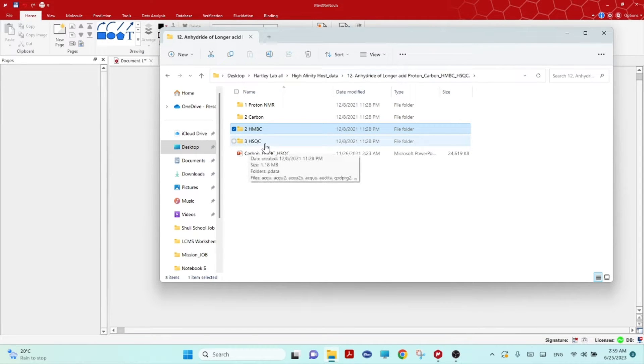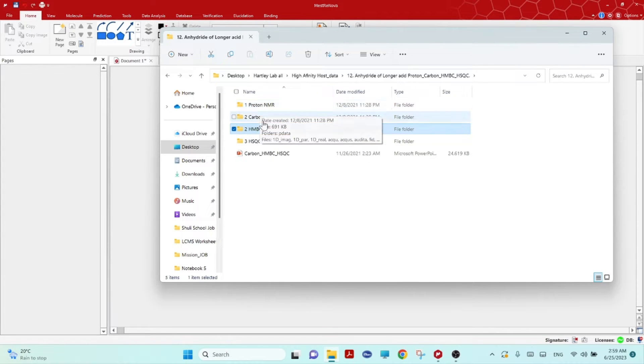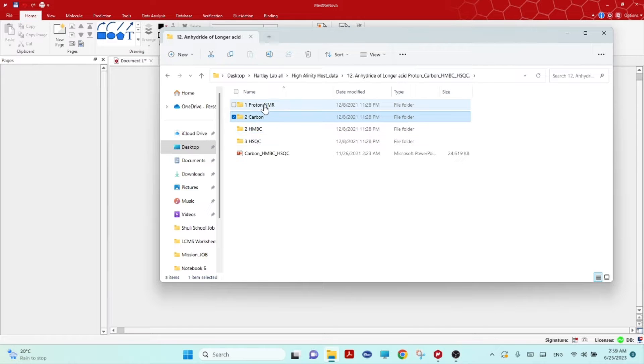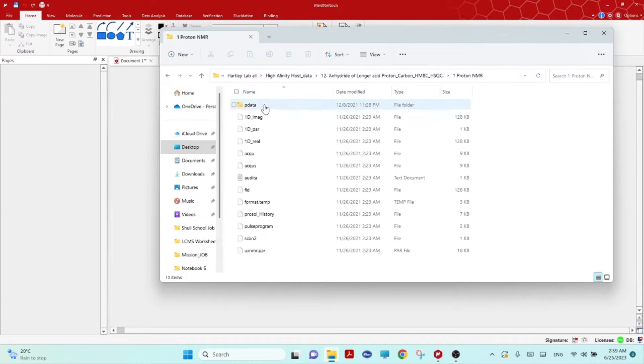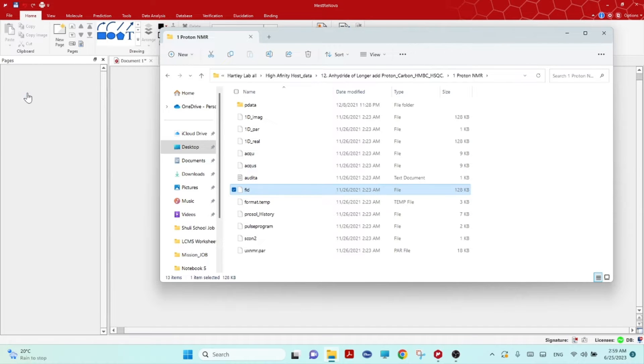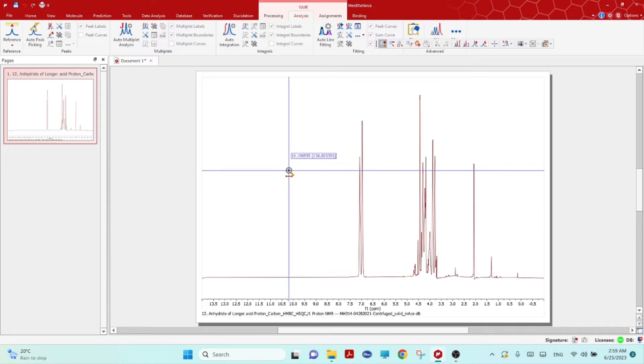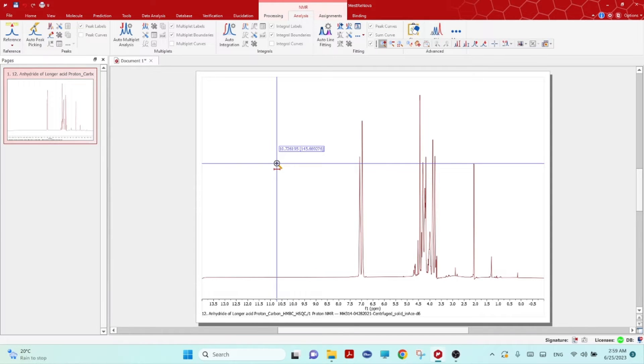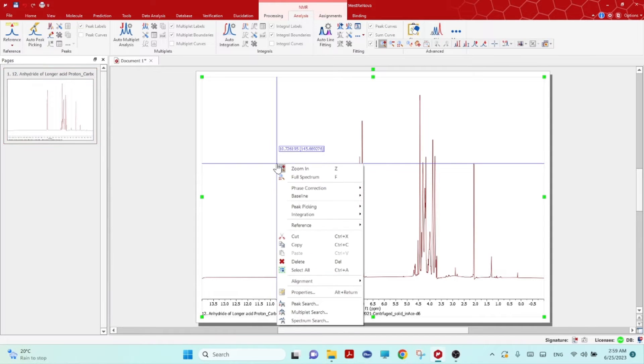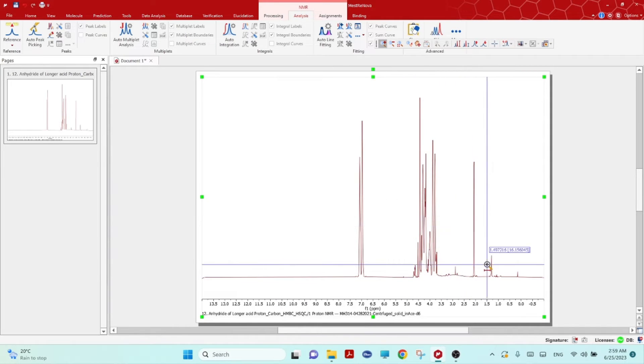First open the 1D Proton NMR by clicking or dragging the FID file here. You will see the Proton NMR opened. Click right mouse and then go to phase and do automatic so it will correct the automatic phase.